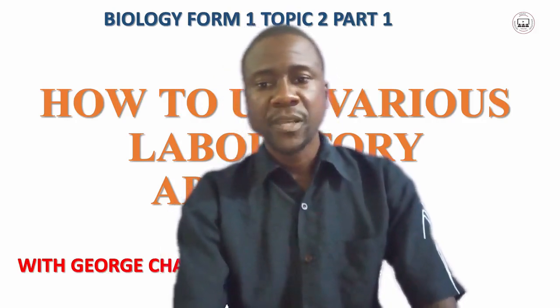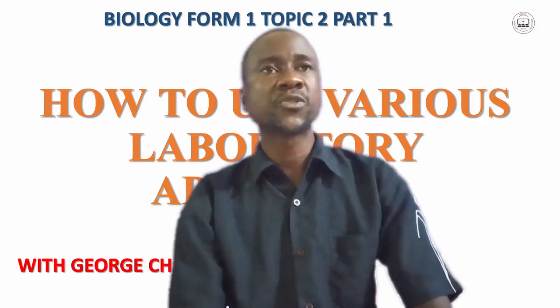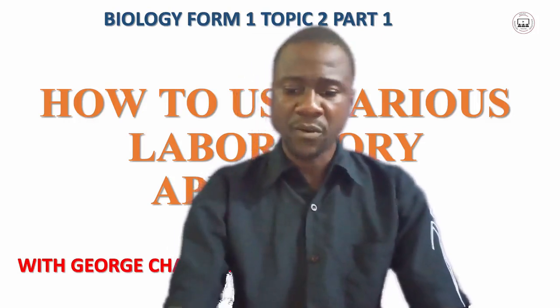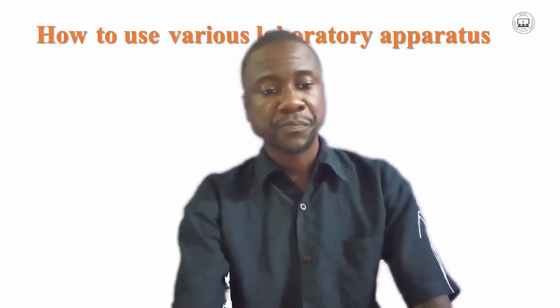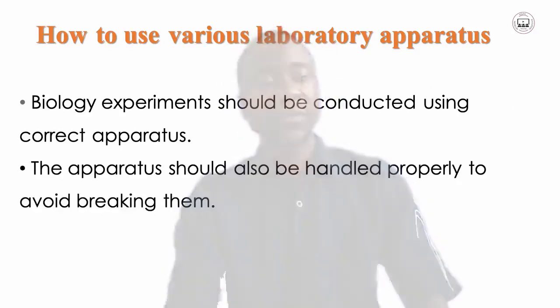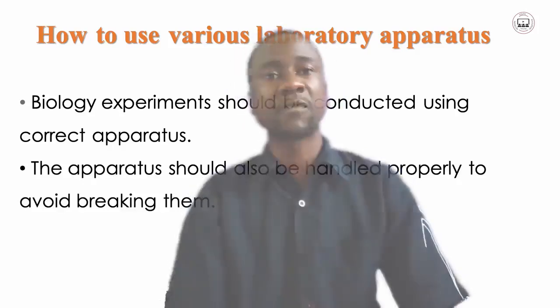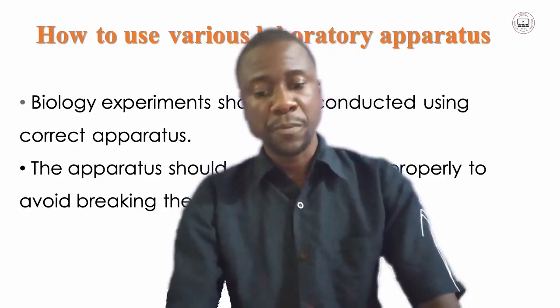Pay attention. Like what I said in the previous lesson, biology is worth with the apparatus. We just shared a number of apparatus, and now we are going to look into how we may use these apparatus using their drawings. A biology experiment should be conducted using correct apparatus so that you get the correct results from the experiment. The apparatus should also be handled properly to avoid breaking them. Some are fragile and some require a lot of care for you to use them.